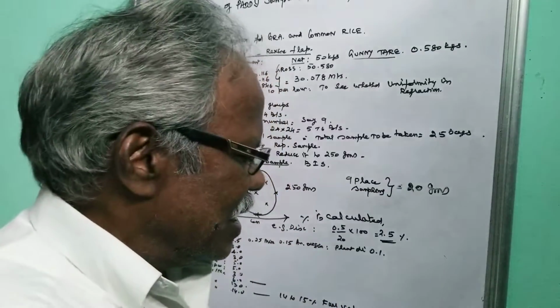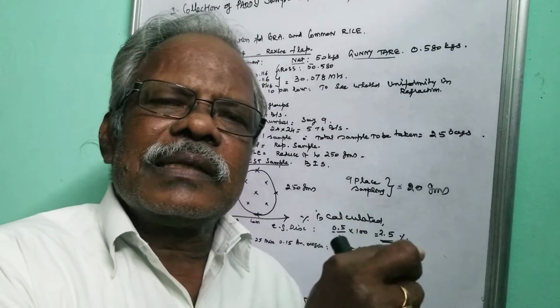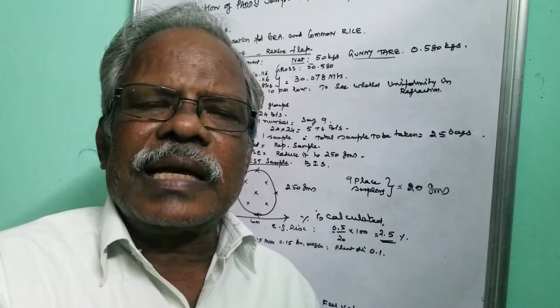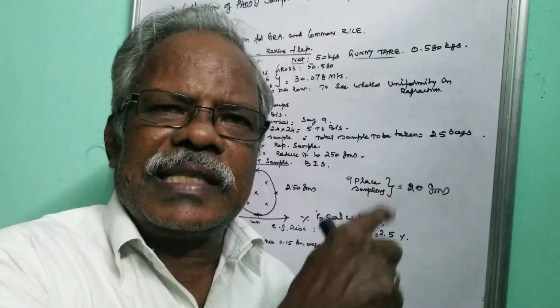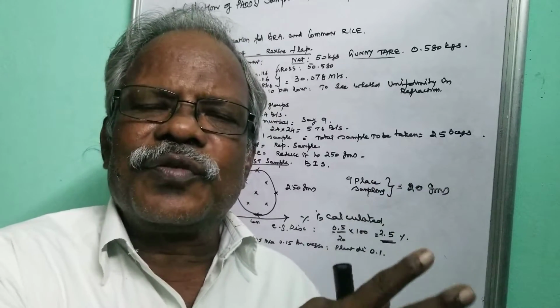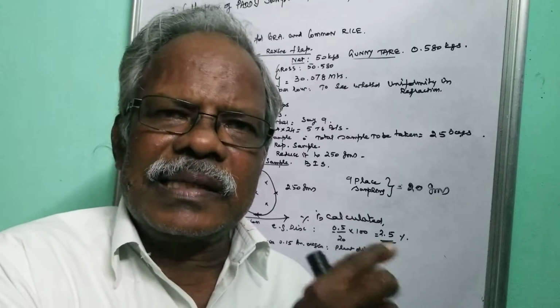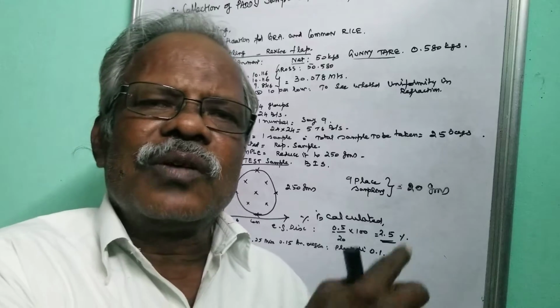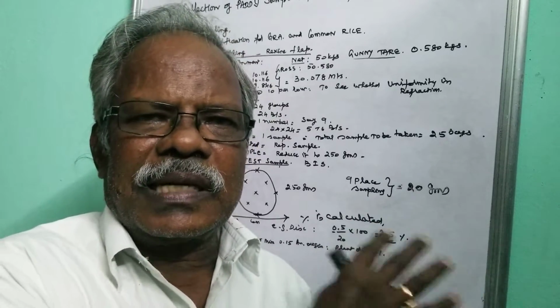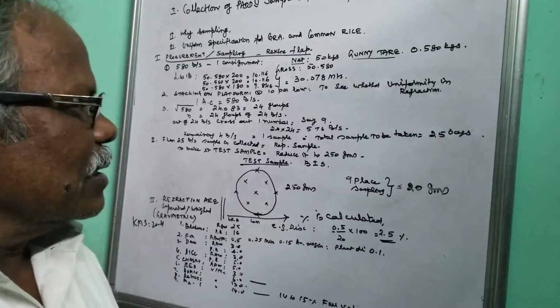That should not exceed 1%. Then 1/4 to 3/4 is called brokens, which is the remaining after deducting 1%. If it is raw rice, if 1% small brokens is there, 24% can be there. Like that, out of 16%, 1% is small brokens, the remaining may be big brokens, that is 15%. That is with regard to the brokens.